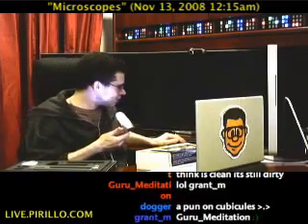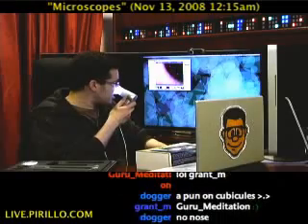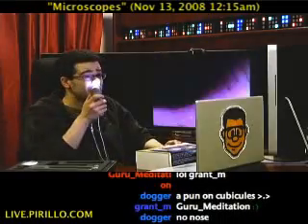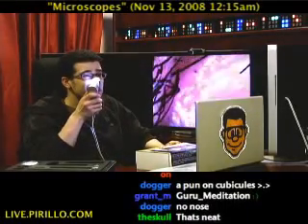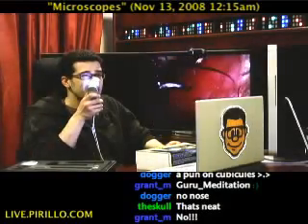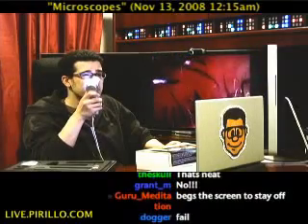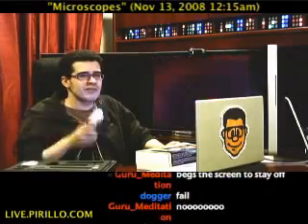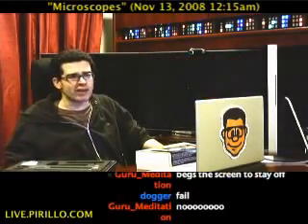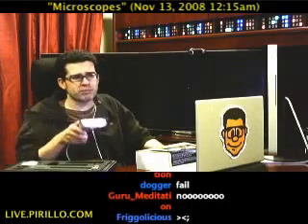This is the true test of a USB microscope — the nose test. My nose was so dark it didn't even show up there for a second. There we go. If you always wanted to know what the inside of Chris Pirillo's nose looks like, this is it. And so help me God, if I see anything moving in there that should not be moving... My nose is just fine, and the microscope proves it.